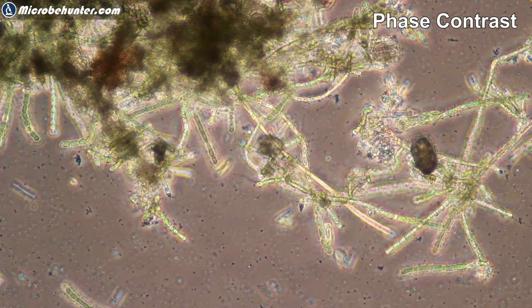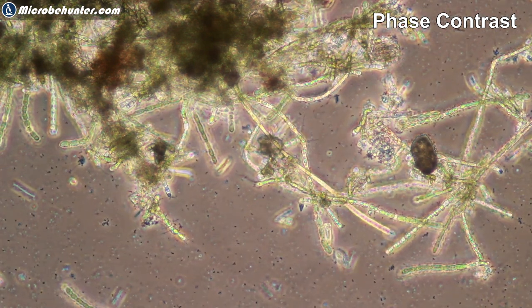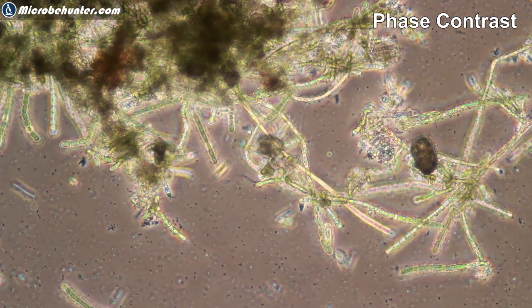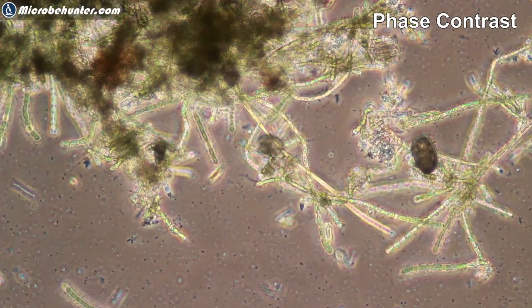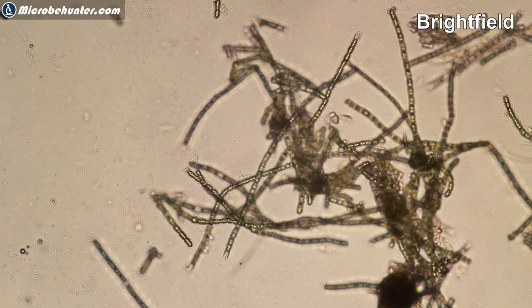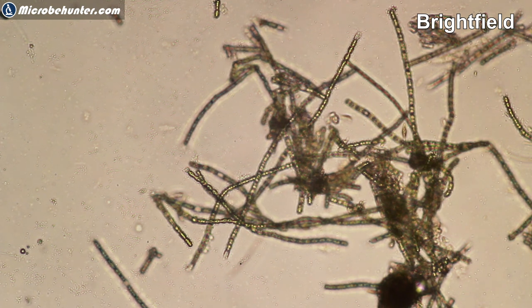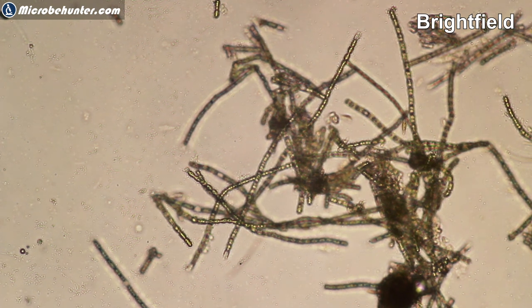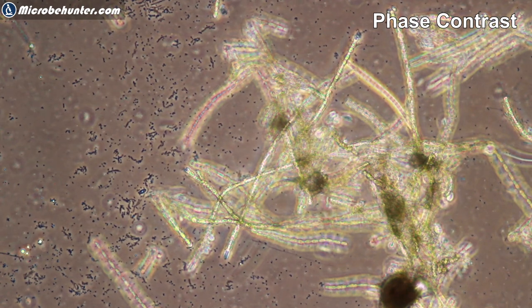These are now visible as dark dots on a brighter background. In bright field, the bacteria are not as easily visible. Look at the background, and you are barely able to see the bacteria because they're very transparent. But in phase contrast now, look here, now they're very well visible, especially on the left side.